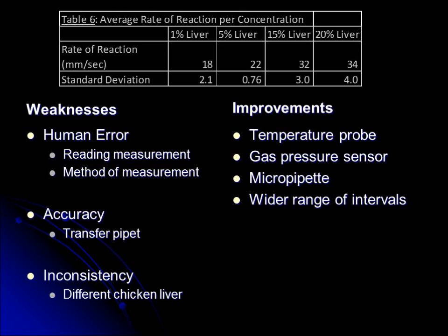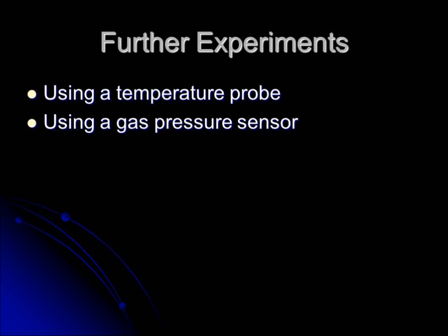This indicates inconsistency in the methods of conducting this lab. Weaknesses in the experiment included human error in reading the volume of liquid in the graduated cylinder, as well as the method of recording the rate of reaction. This can be improved by using a temperature probe or a gas pressure sensor. Another weakness included inaccuracy due to the use of transfer pipettes, which can be improved by using a micropipette instead. Inconsistency also played a role; the lab should be performed on the same day, ensuring the use of the same chicken liver. A wider range of intervals should be used to produce more significant results. Further experiments include using a temperature probe or a gas pressure sensor to increase the accuracy of the results.